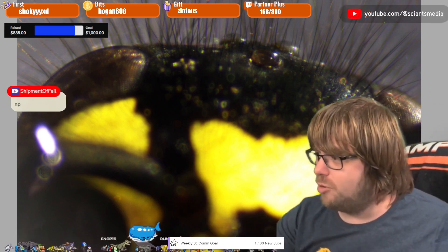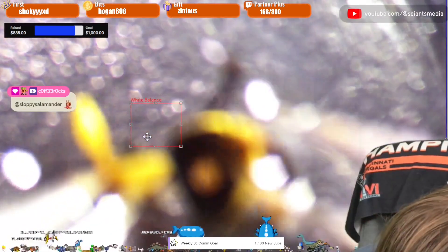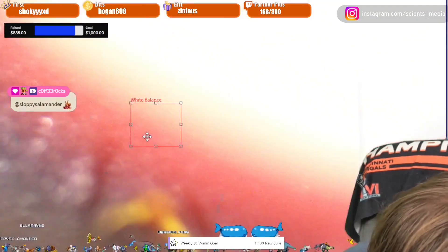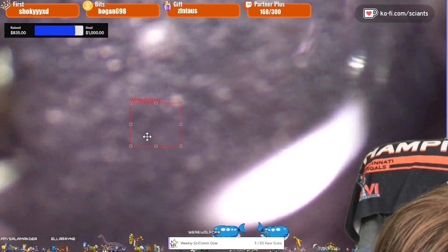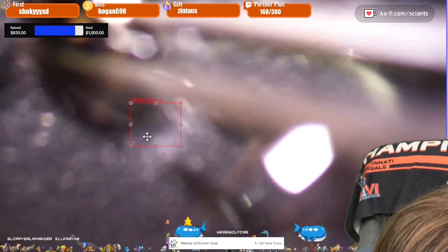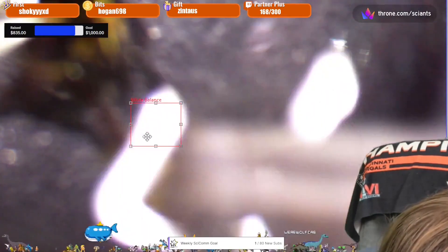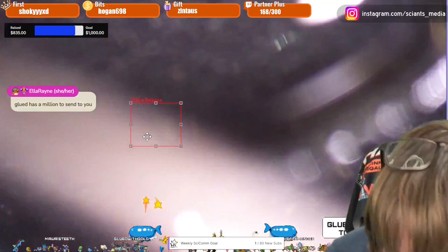Are y'all ready? Should we pop open this head and see some brains? I'll try to get it in focus and pause where I can. Remember, this is my first wasp head dissection. The procedure isn't going to be any different from when we've done an ant brain or a fruit fly brain - it's just knowing how hard the exoskeleton is that I have to be careful about, because if I pull too hard it's just going to rip the brain.